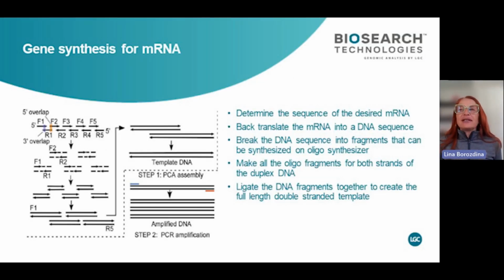Okay, gene synthesis. It is applicable in many fields right now. The most talked about one right now is gene synthesis as a template for mRNA. However, this is something more current, but gene synthesis has a very long history and quite interesting development. What put gene synthesis at the forefront of everybody's eyes was the Duke University poliovirus glioblastoma treatment.